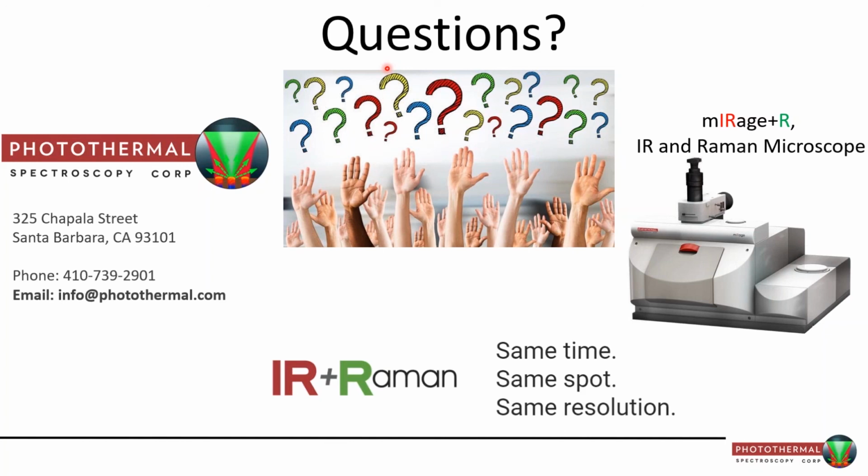We have had a few that have fluoresced, which was honestly the end of the road for us when we just had Raman, if that was all the signal we could get. But now, even with those, we've been able to get some really nice photothermal IR spectra. That's been helping us, because before, a chunk of our pie chart was a fraction that was fluorescent and we didn't know anything else about it. But now the IR has been able to give us some information about those. So yeah, we haven't really had any particles yet that we just didn't get any signal from. We've been fortunate, but that hasn't been a thing.